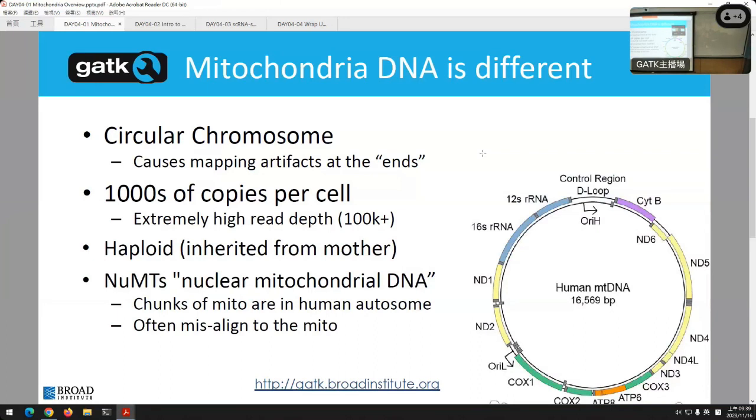And that's the other thing. As mentioned here, there are tons of mitochondria per cell, thousands of copies of the mitochondria. And what that means is that whenever you sequence a cell, by the way, and whenever you have any kind of human data that comes out of there, you're also going to get mitochondrial data, like it or not, right? And the harder thing about mitochondrial data, too, is that how much is there relative to your standard autosomal DNA actually depends on the tissue type.